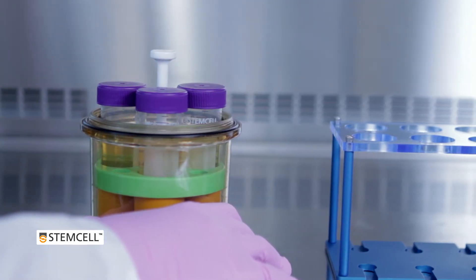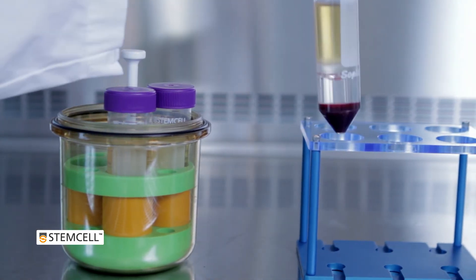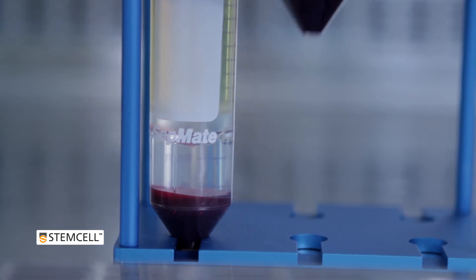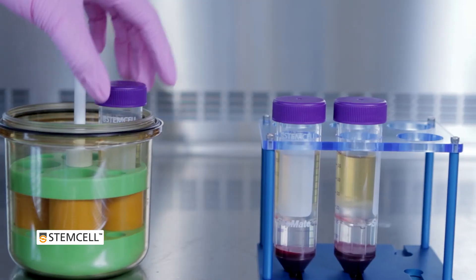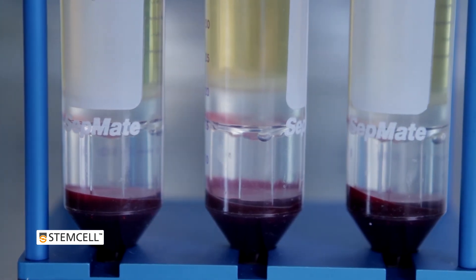Red blood cells and granulocytes pellet to the bottom of the tube during centrifugation, while PBMCs remain above the insert. Some red blood cells may be present on the surface of the insert, but these cells will not affect the purity of your PBMCs.